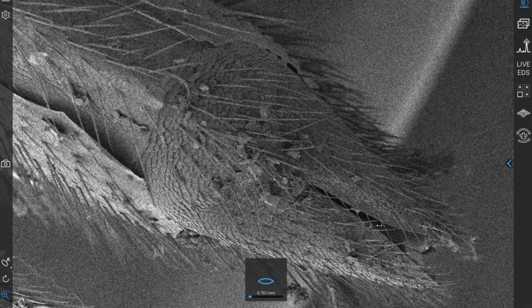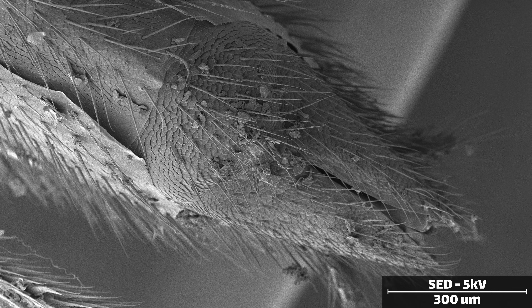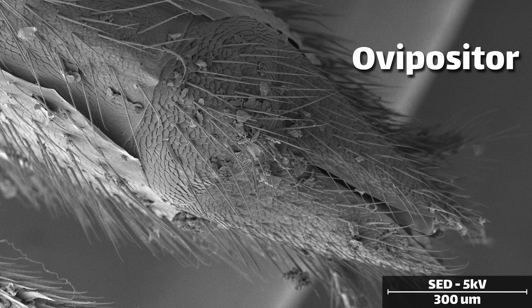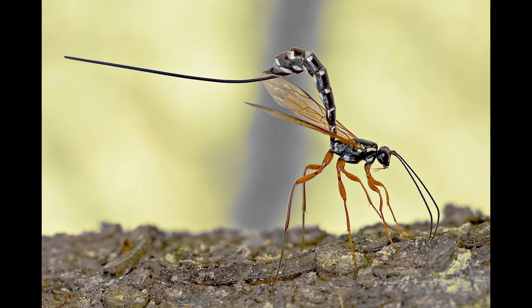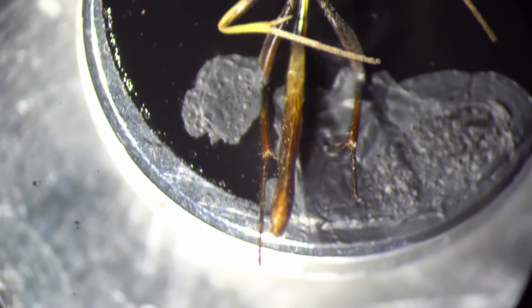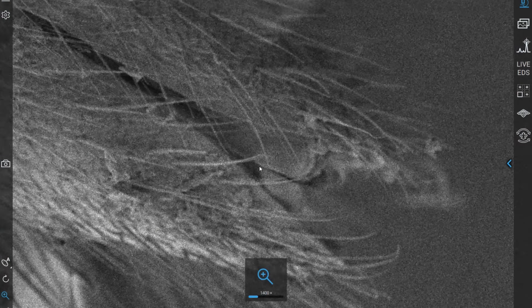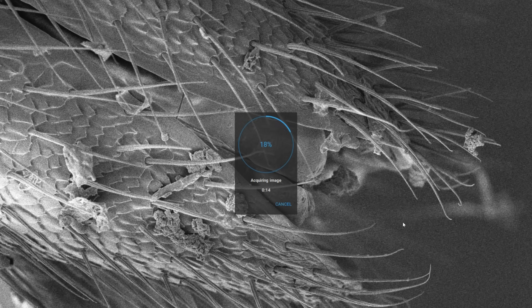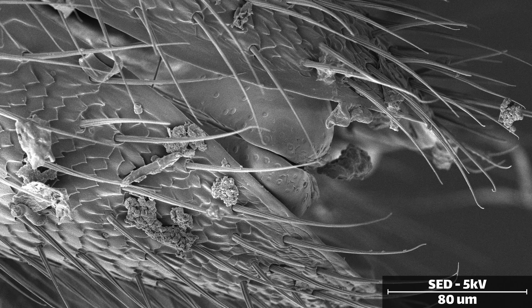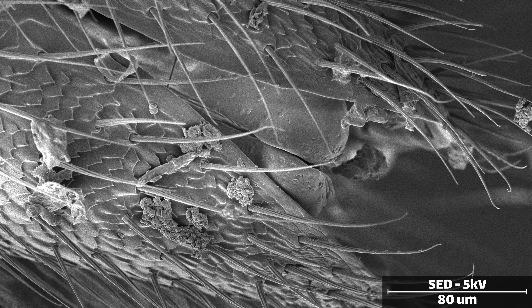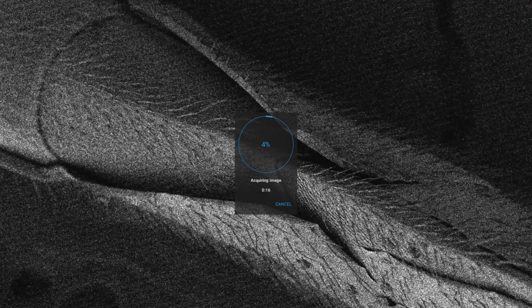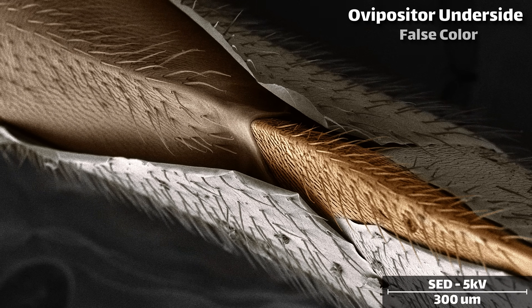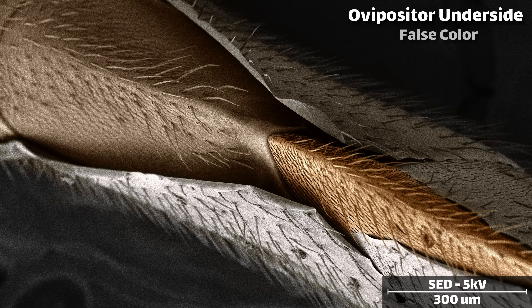Parasitic wasps will lay their eggs with a special stinger-like appendage on its tail, known as an ovipositor. They come in all shapes and sizes depending on the function — some are quite long so that they can bore inside of trees, while others are short and stubby. The sharp business end of the ovipositor on this specimen is likely retracted inside of the body.